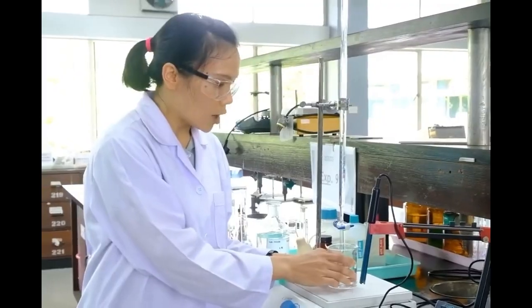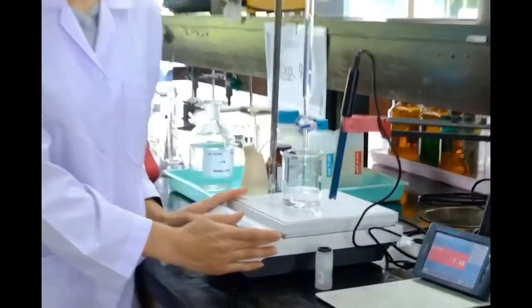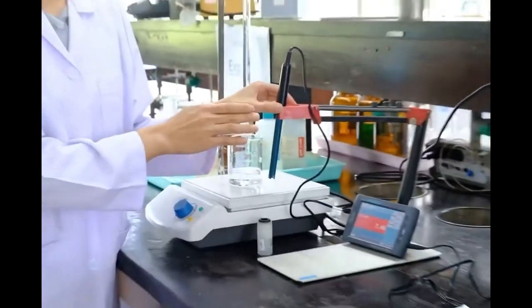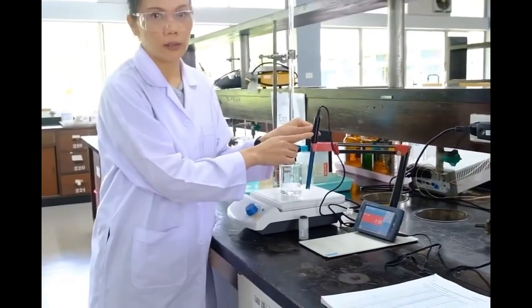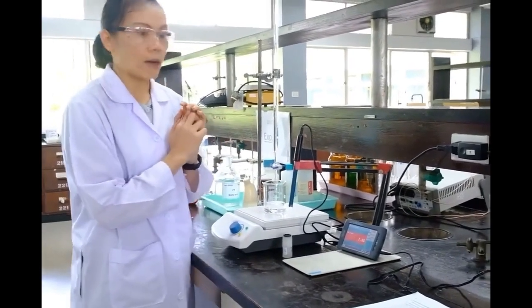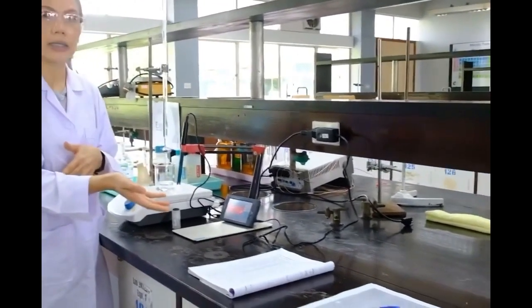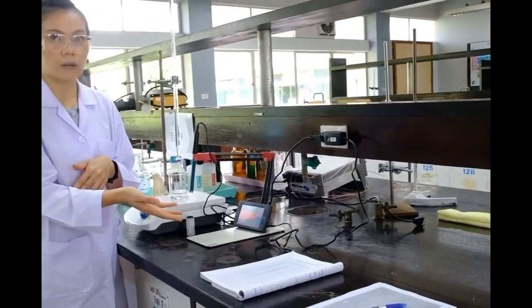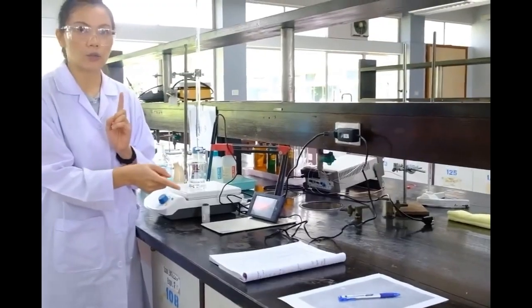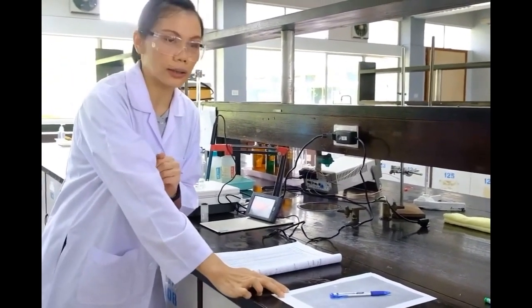A magnetic bar placed on a magnetic stirrer. A pH meter. This is the pH probe for measuring pH. And a ledger. One student will be responsible for recording the experimental results. And another student will plot the pH graph from the data.